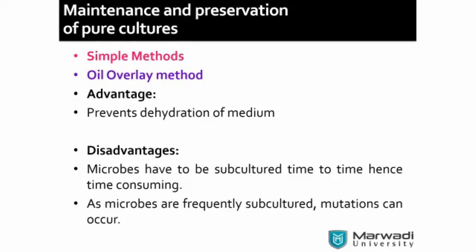Sometimes many people switch on the defrost in the single door. Otherwise, they leave it open for 1 or 2 hours, and it's going to get melted. Both ways are possible. Previously, the buttons were not there. Nowadays, it's coming for making a defrost. So these are the two different advantages and disadvantages of each thing.